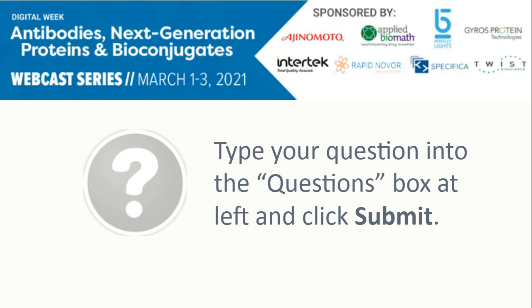We do have some ongoing projects with mice. We're just waiting to receive those bleeds from our partner and put them through the protocol. But particularly with these transgenic mice, I know the advantage: you're working with human antibodies, and that's great. I've got some friends in these companies as well, and we've been chatting about it quite a bit. But one of the other problems is actually that a lot of these mice are built for diversity.